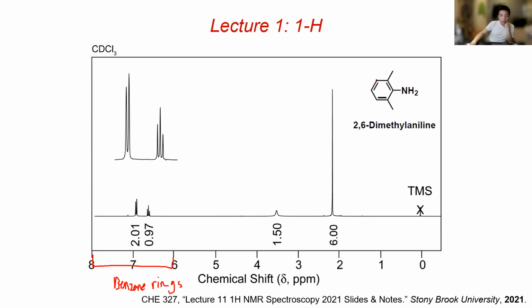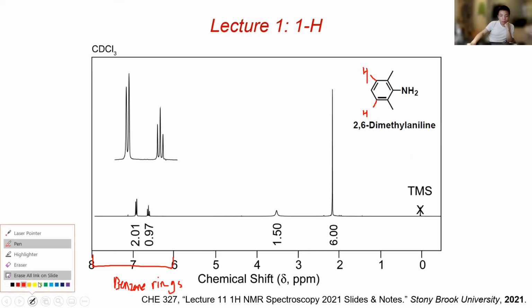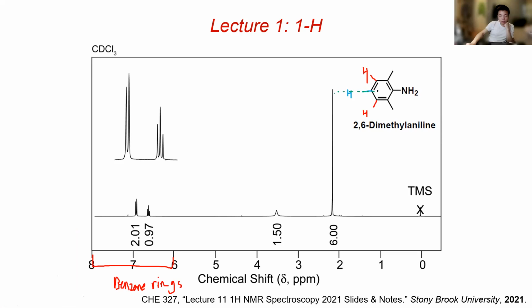We have 1 carbon, we have another carbon, and we can see that there's a nice symmetry going on here. So that's why we have an integration of 2.